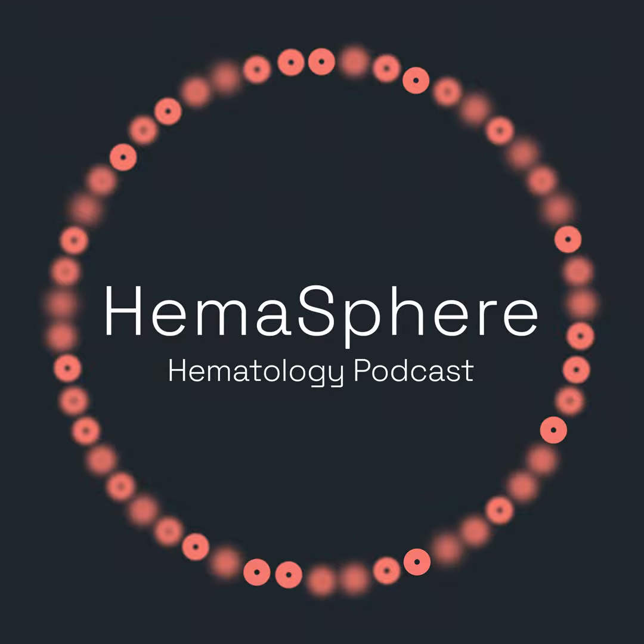And you can then teach an algorithm to replicate or learn from these labels and link them to the cells. That works really well for these rare cells, but AML has a lot of different phenotypes. So to teach an algorithm about all of these different patterns, you probably need hundreds to thousands of examples. We might be able to do that in our center because we perform a centralized flow assessment here. But for smaller clinical centers, that's really not possible, I think.